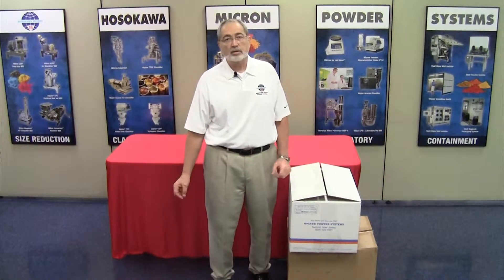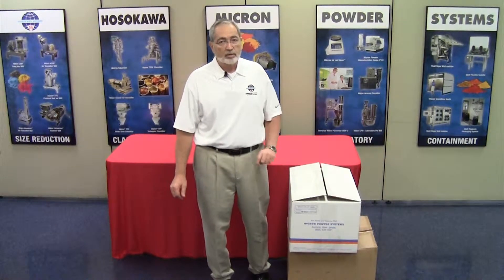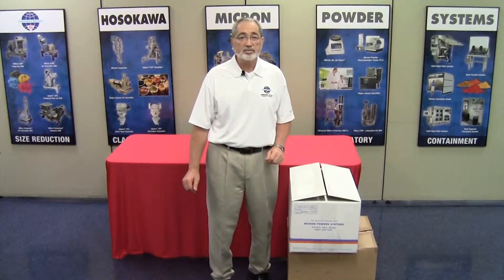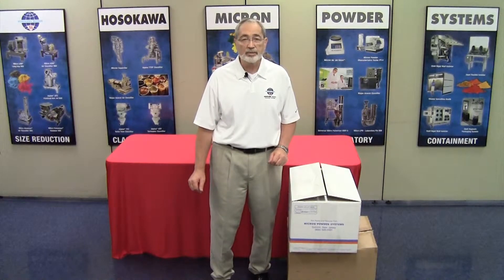Hello, my name is Tim Calvo. I'm with Hosokawa Micron Powder Systems Laboratory and Analytical Equipment Group. Today we're going to show you the process as to how to set up your recently purchased MAJS-B, which is the Micron Airjet Sieve version B for basic.